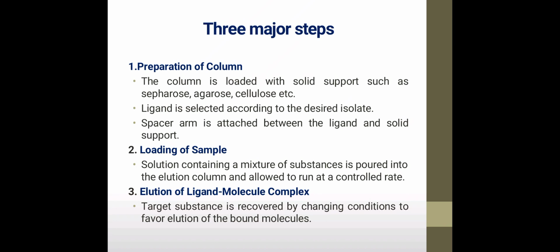Then the third important step is the elution of the ligand molecule complex. The target substance is recovered by changing the conditions to favor the elution of the bound molecules. So after binding, the elution process can be carried out successfully by making such modifications.